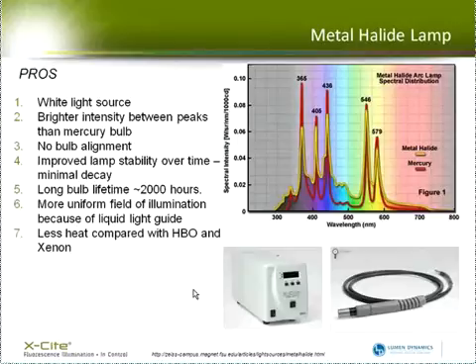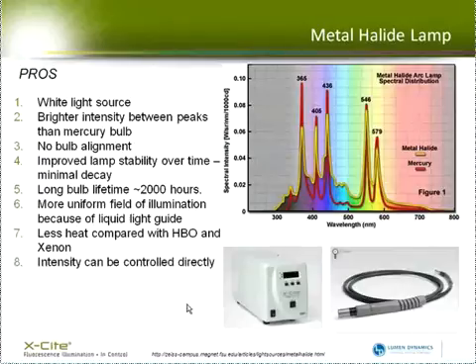Less heat compared with the HBO and the Xenon, and the heat is isolated in this box away from the microscope. The other thing is the intensity can be controlled directly, so you can actually say I want 1% or 5% or 10% of my lamp power.